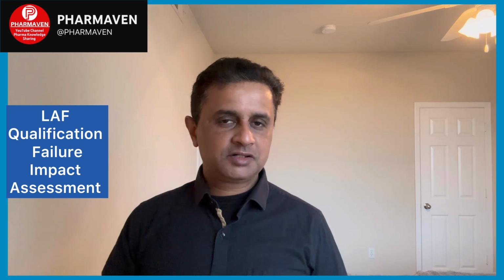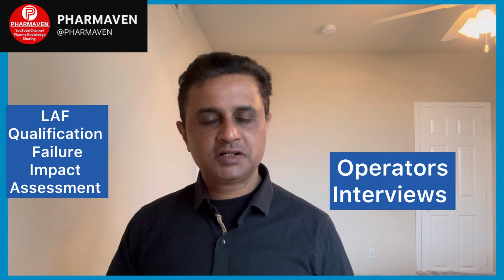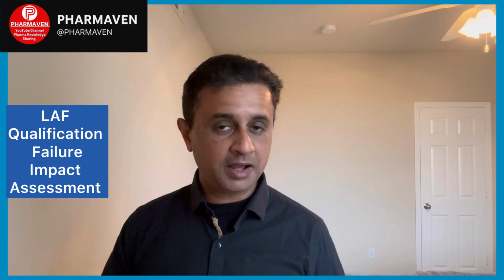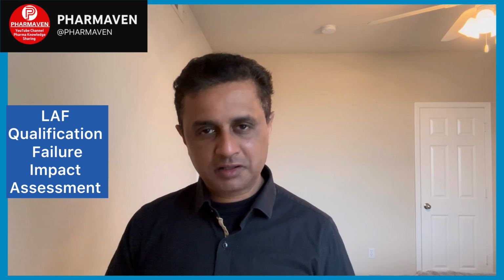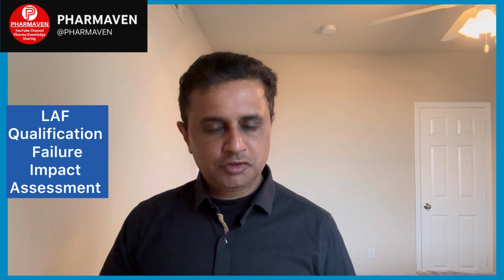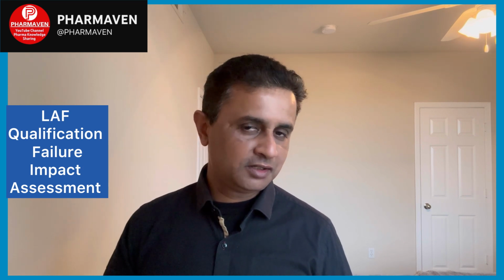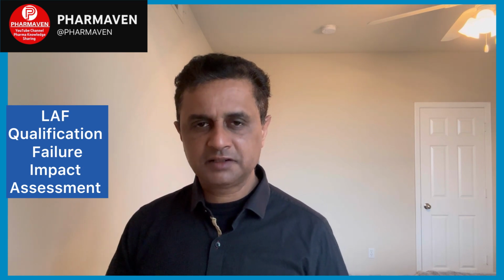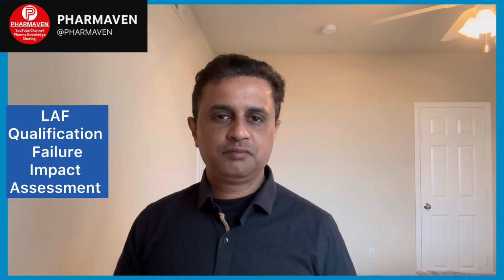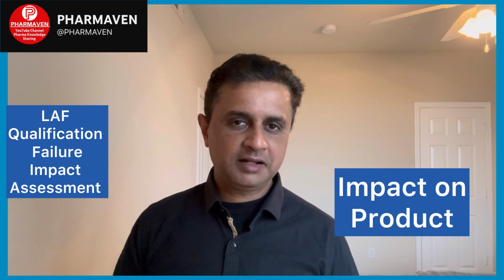So gather all this data and interview the operators on how they operate, and whether there was any specific incident in previous times, just before the requalification or in the recent past, any problem, cleaning issue, maintenance issue or incident. Talk to the operators and ask whether anything went wrong in the recent past. Try to understand. Based on all these details, compile the data and figure out whether it can have an impact on the products which were processed under that LAF.